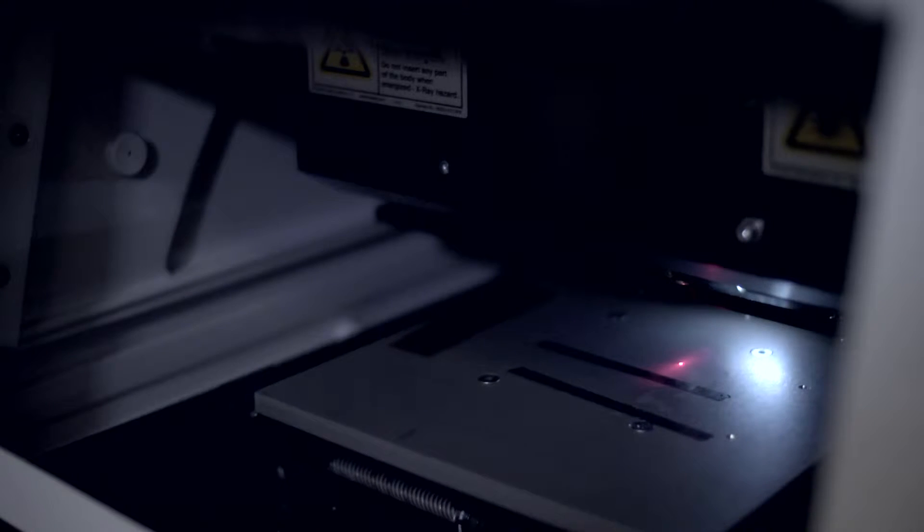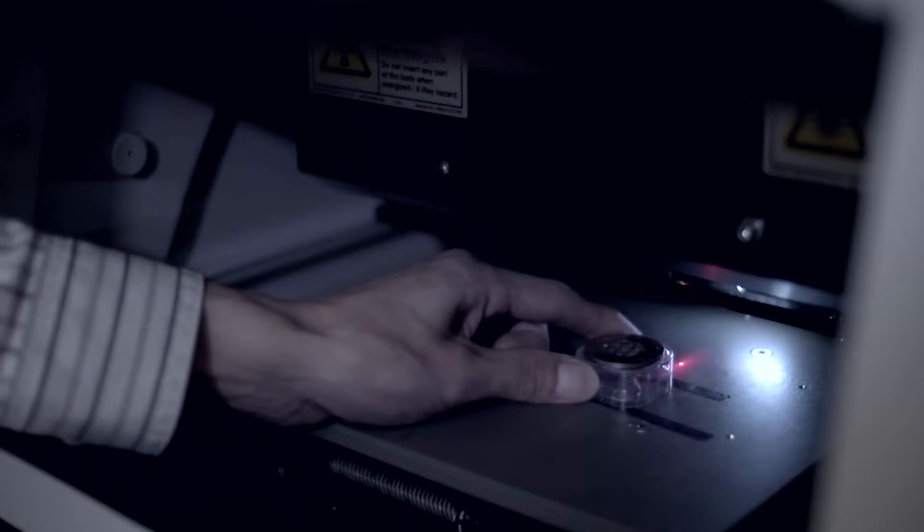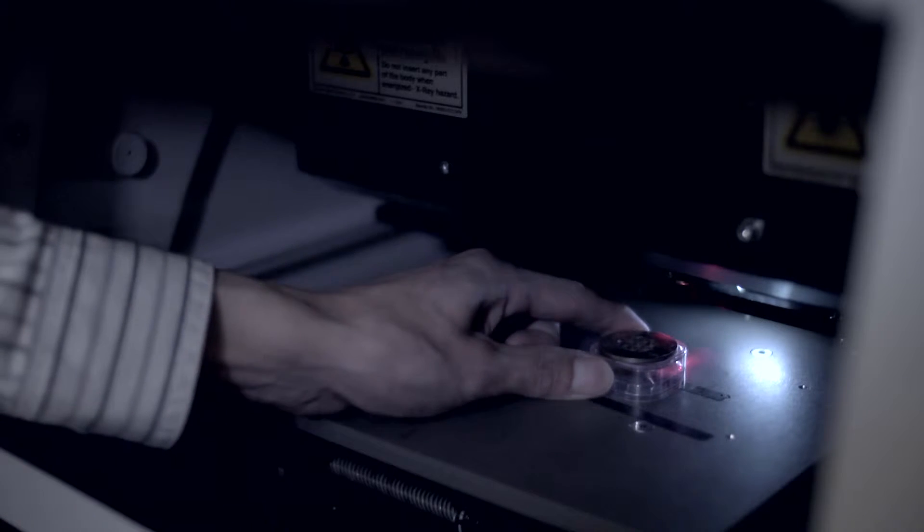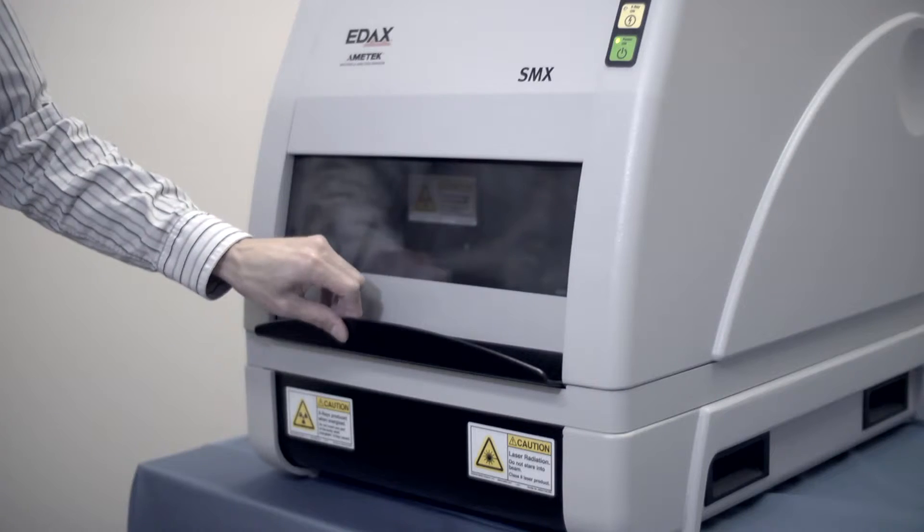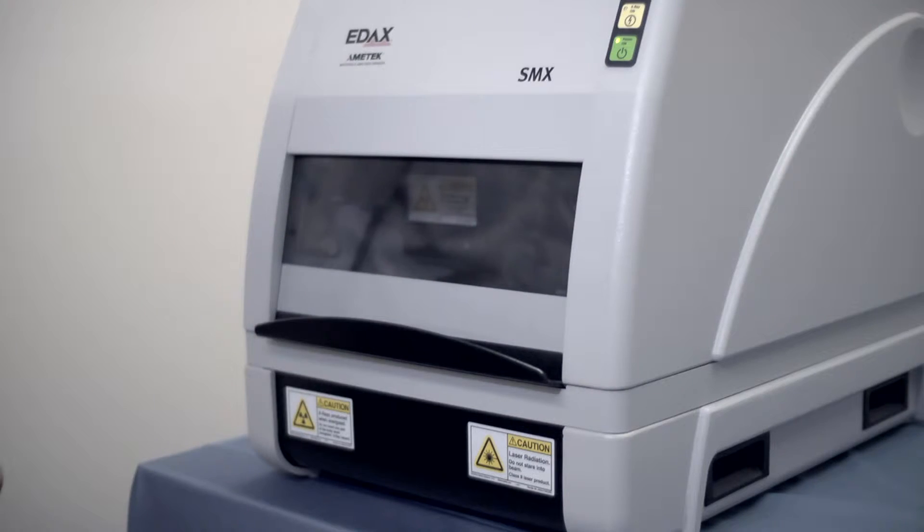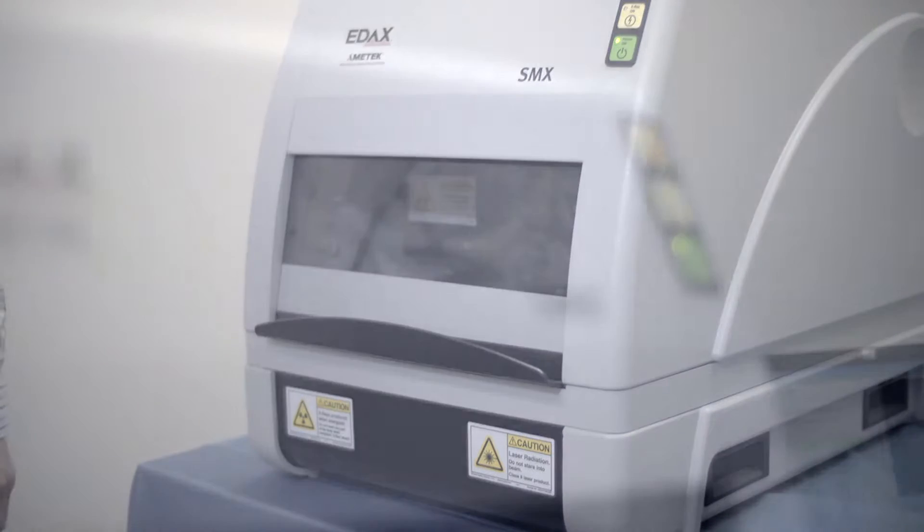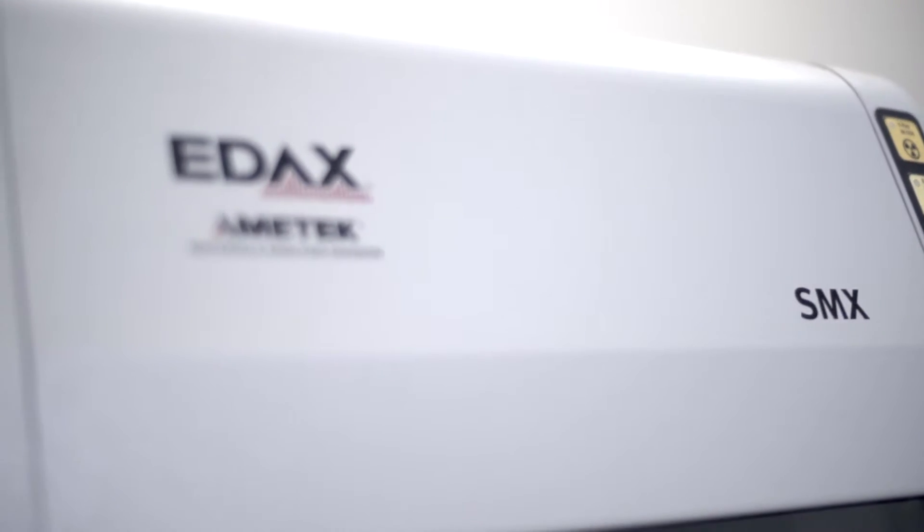The Excellence SMX Ben is a benchtop energy dispersive X-ray fluorescence analyzer that provides non-destructive coating thickness and composition measurement for process development, process control, and quality assurance.